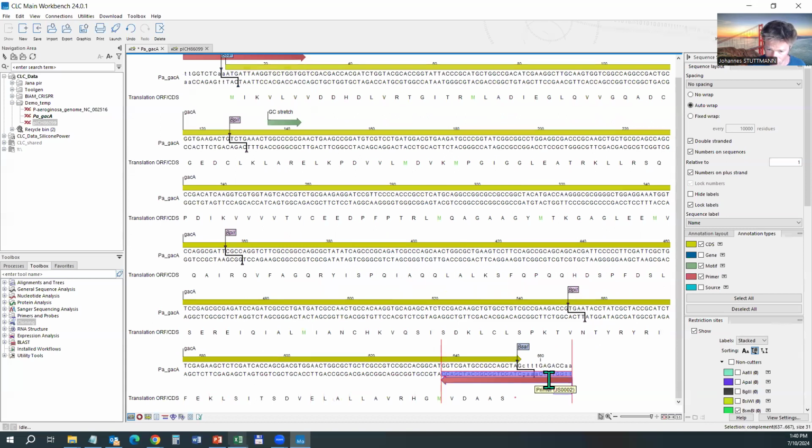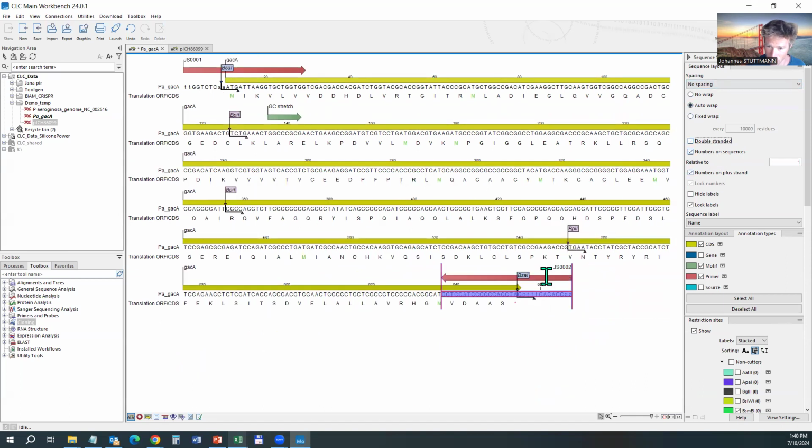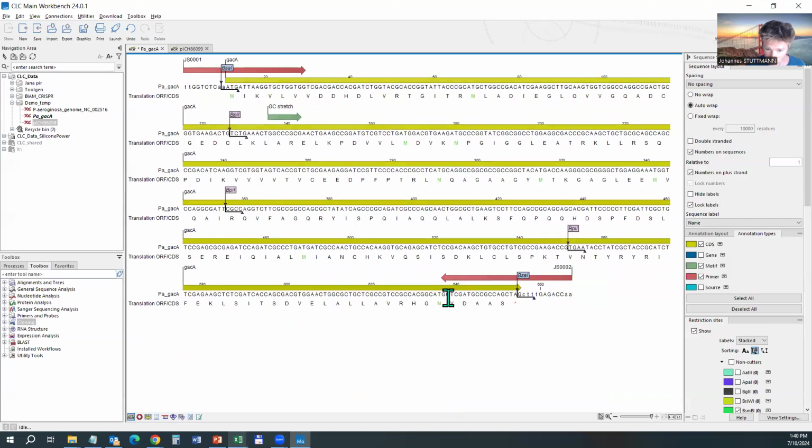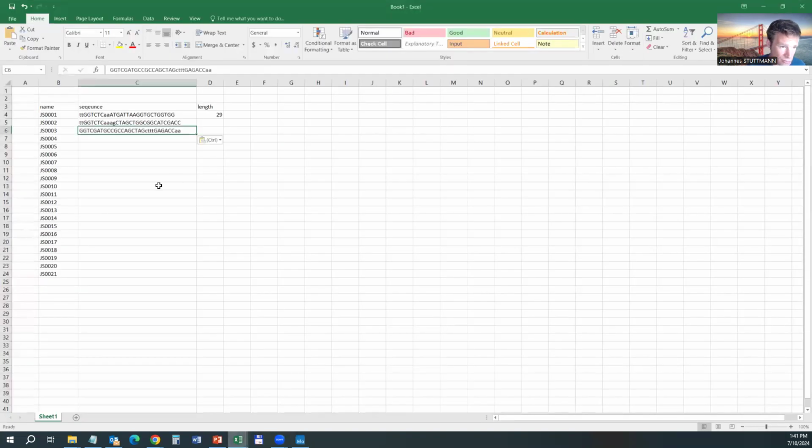While if I double click on this one, I get this sequence highlighted, yeah? So if it's single-stranded, you don't see it, but it's still the same sequence. So it should start now with a TTGGTC. Actually, did I copy? I don't know. The thing is that if I select it like this, it will be the 5' 3' sequence as visible on the screen. So GGTCG. Completely different story. Yeah, so you have to pay attention to this, of course.